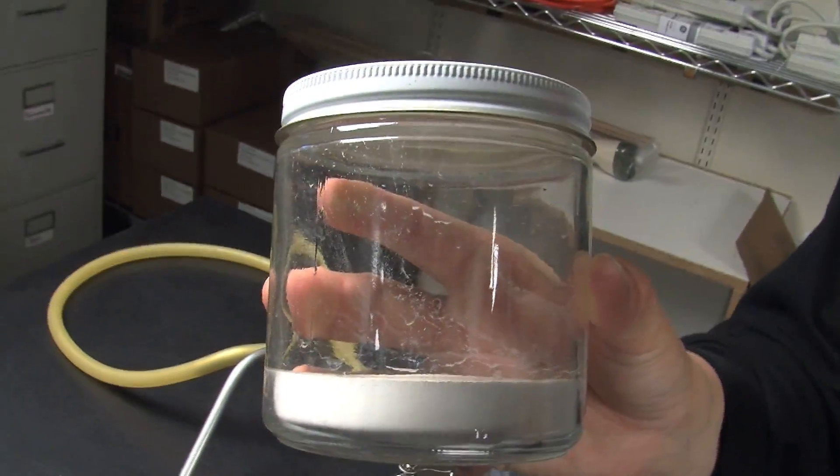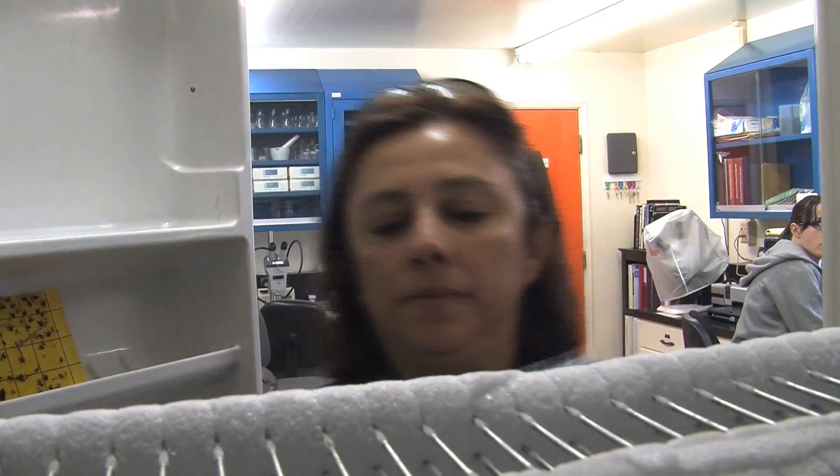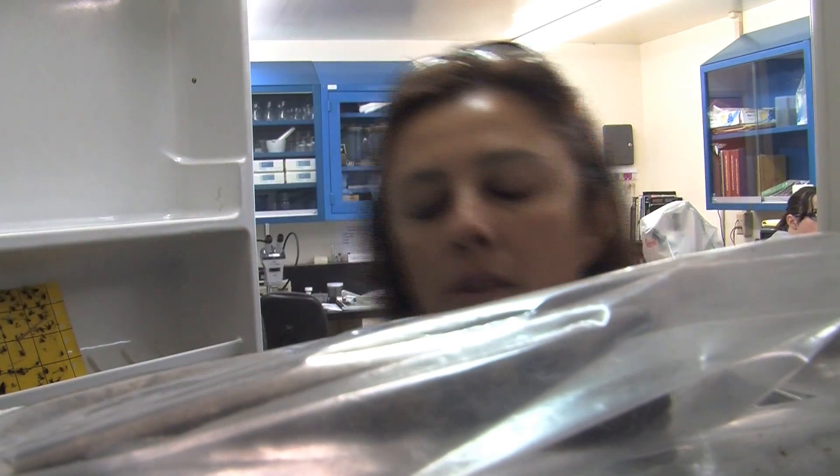Once insects are collected, put them in killing jars for several hours. You can also kill insects by putting them in the freezer for one day. Some insects may take longer to be killed by freezing. Take them out after they are dead but before they dry out and are stiff.